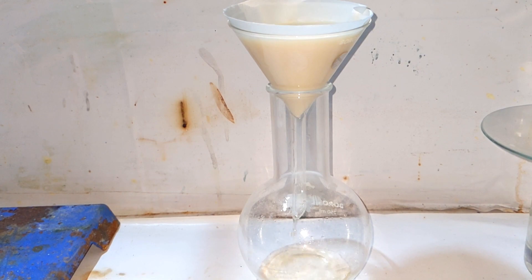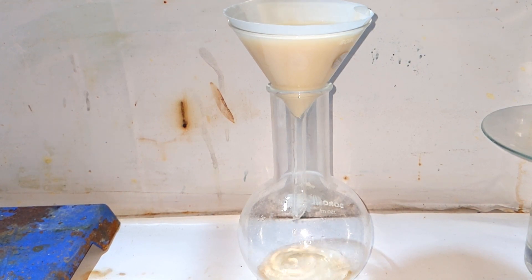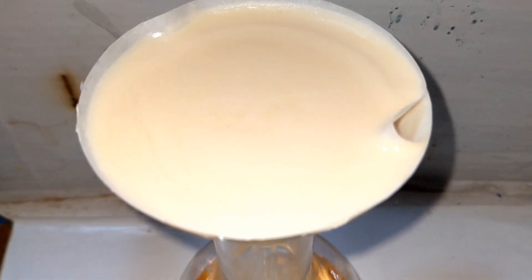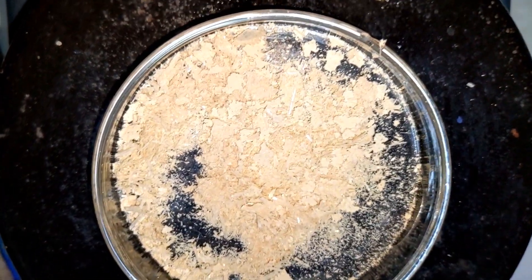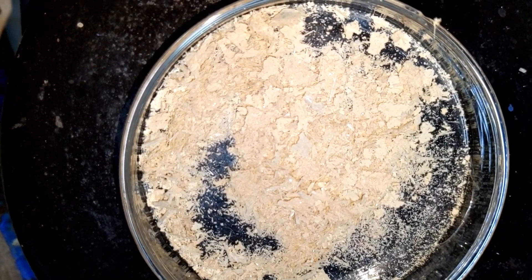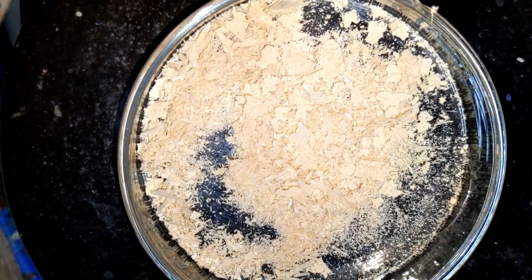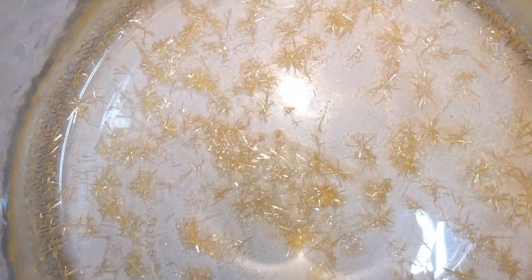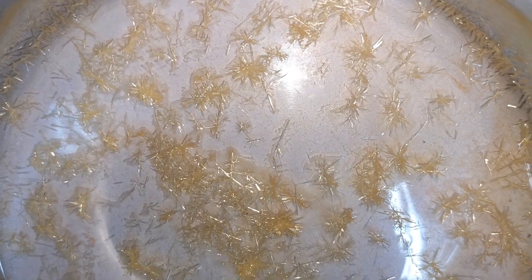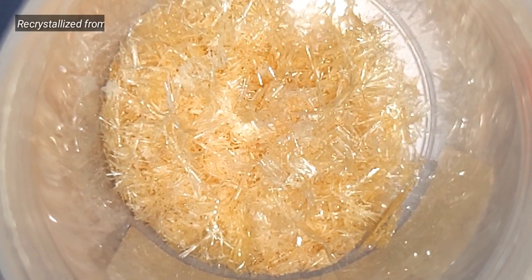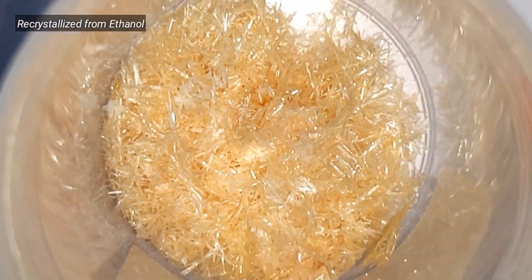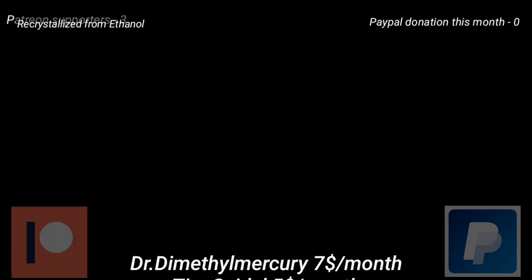The crude phenytoin was filtered by a simple gravity filtration method. After drying, this is the crude product phenytoin that we obtained. It was then allowed to recrystallize from ethanol, and the needle-shaped crystals of pure phenytoin were stored in an airtight bottle.